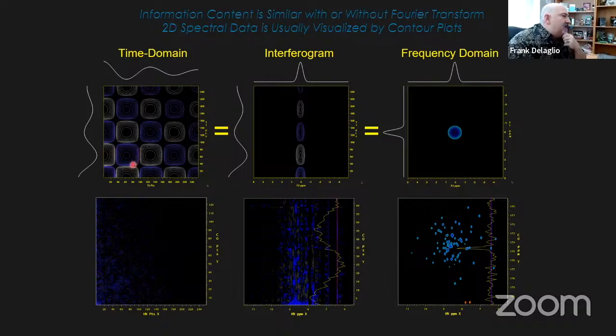Because of the fact that the underlying signals are 1D signals that are modulated in another dimension, all the signals in an NMR spectrum have this underlying form where a two-dimensional signal is actually expressed as the product of two one-dimensional shapes.